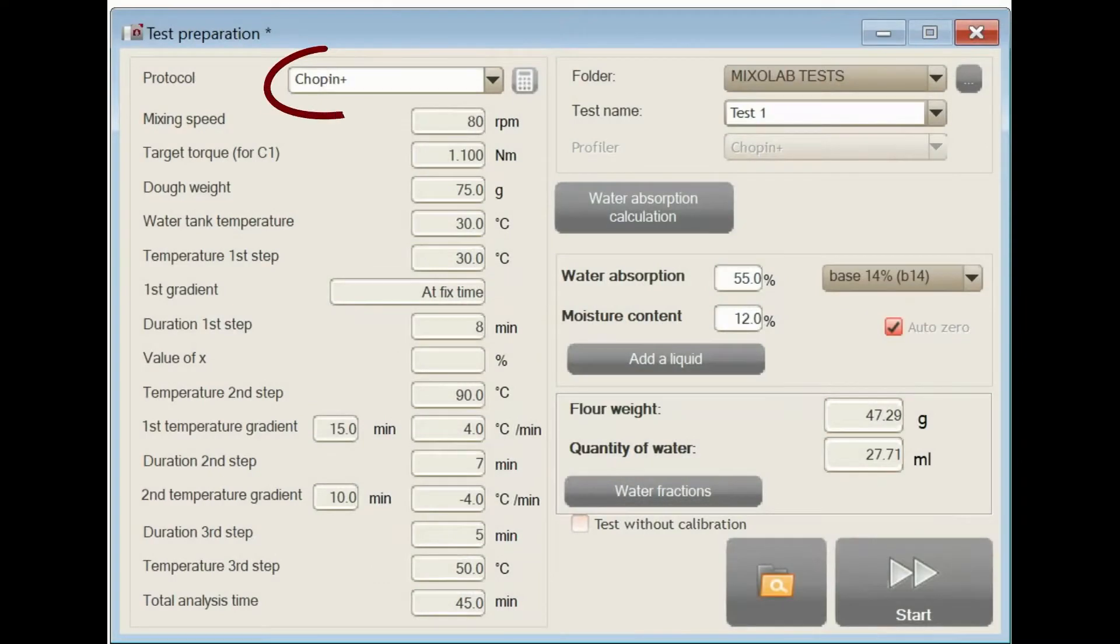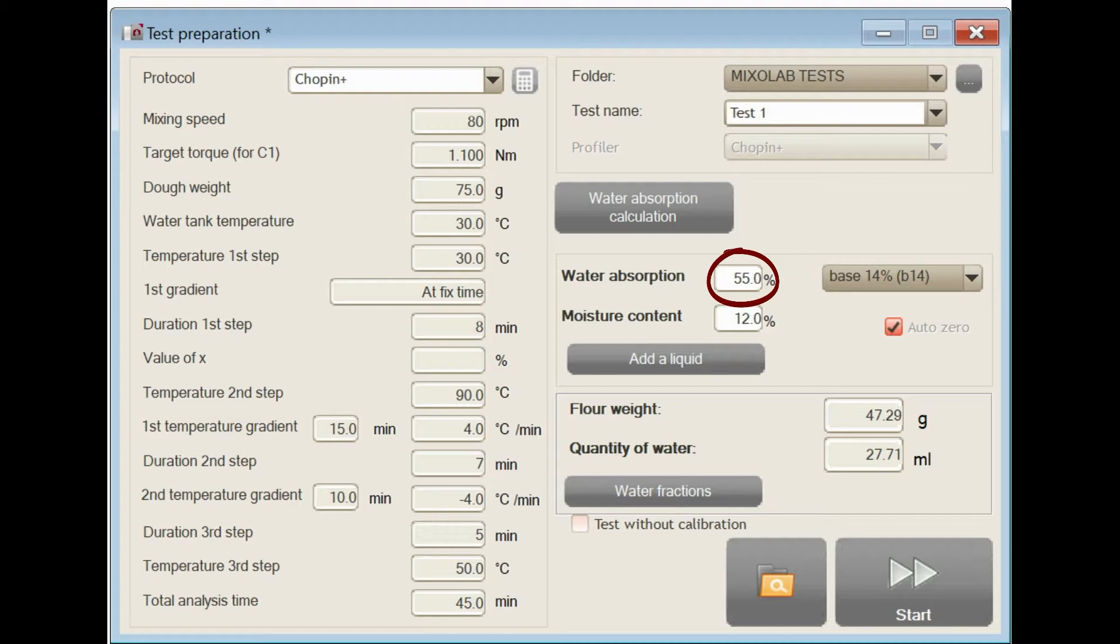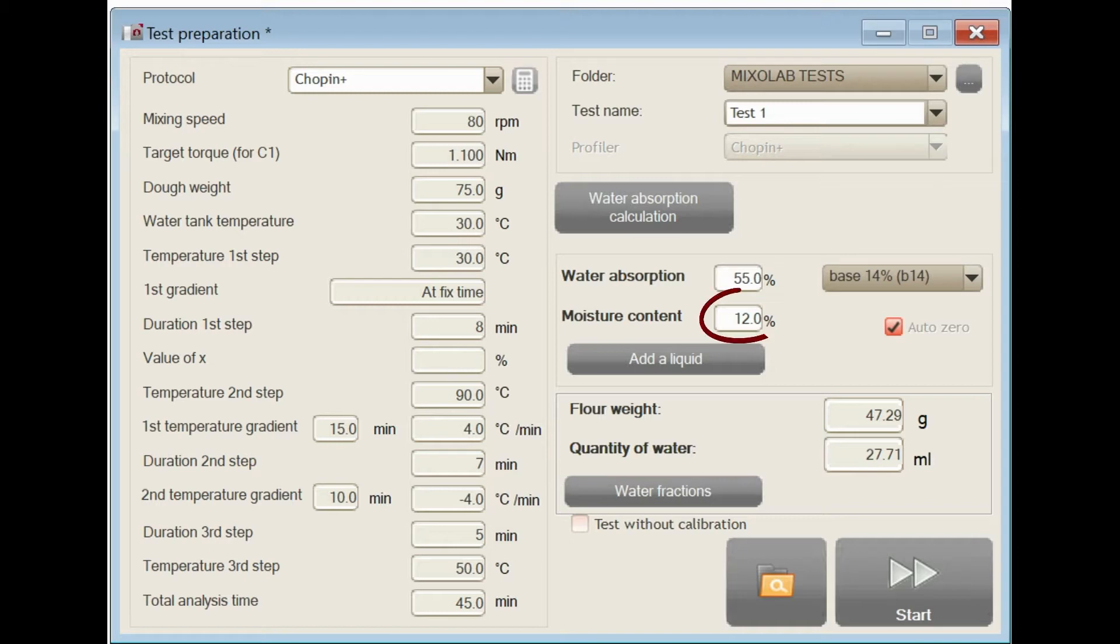You are going to select a protocol. For this video, we will take the example of the standard Chopin Plus protocol. You will also need to enter the desired hydration. We recommend to use 55% for white flour and 60% for whole grain flour. You will then enter the hydration base, always 14% for standard Chopin Plus protocol, and the water content of the sample that has been measured beforehand.